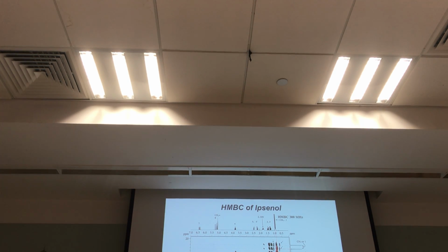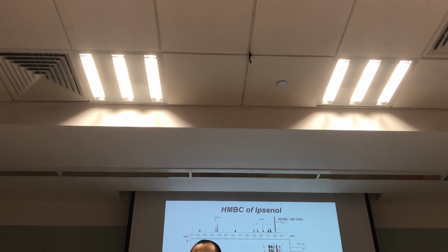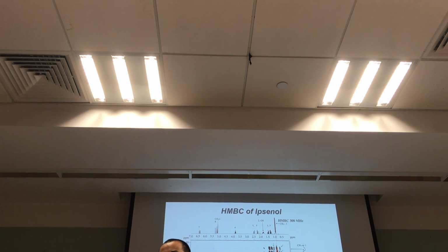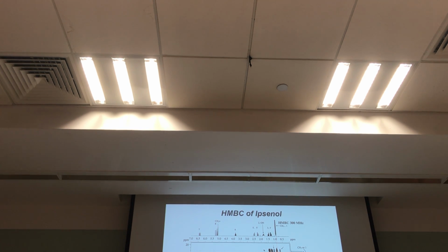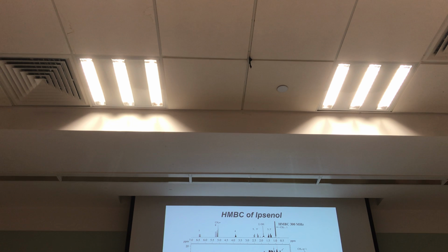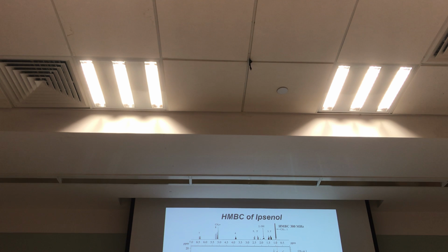But for HMBC, for one proton, you draw one line, you can see up to how many? How many? Can you count? Twelve. Is it 12?